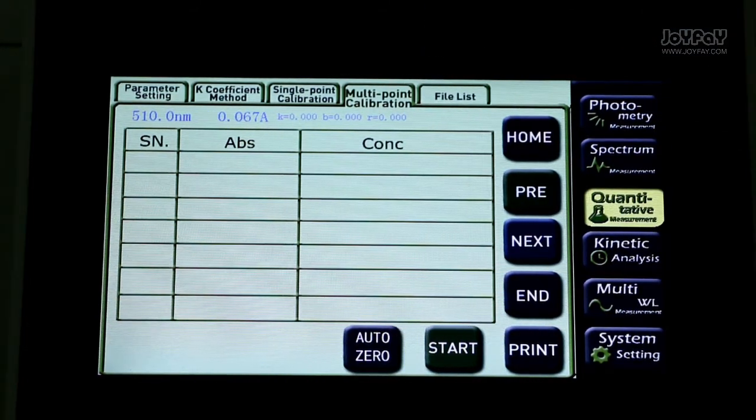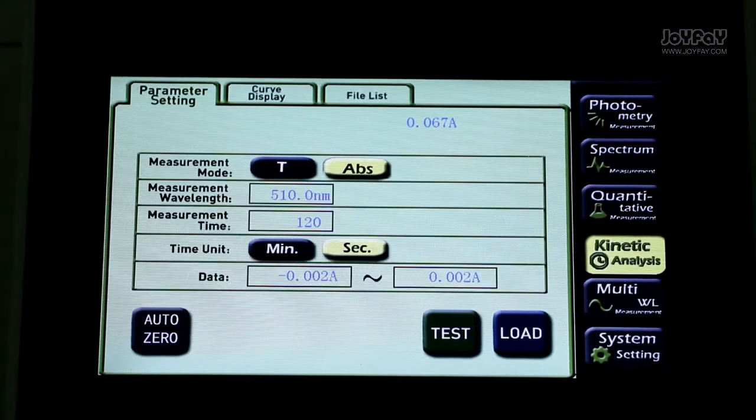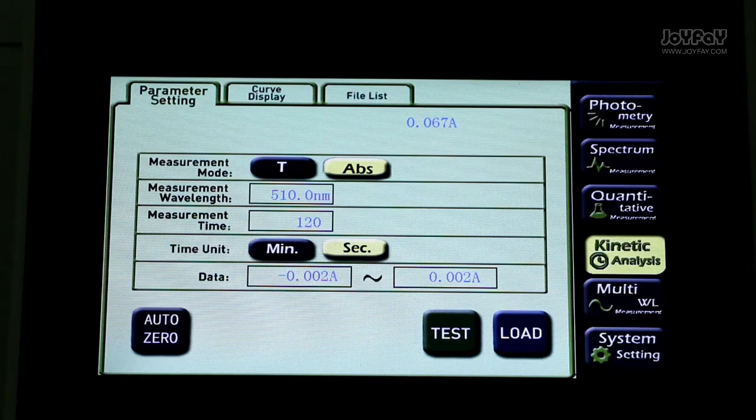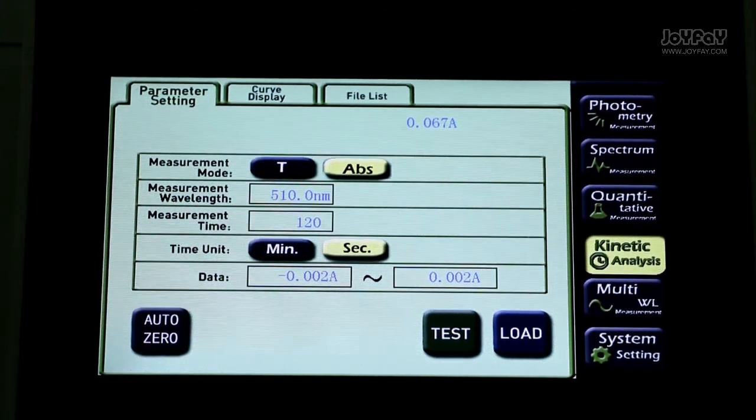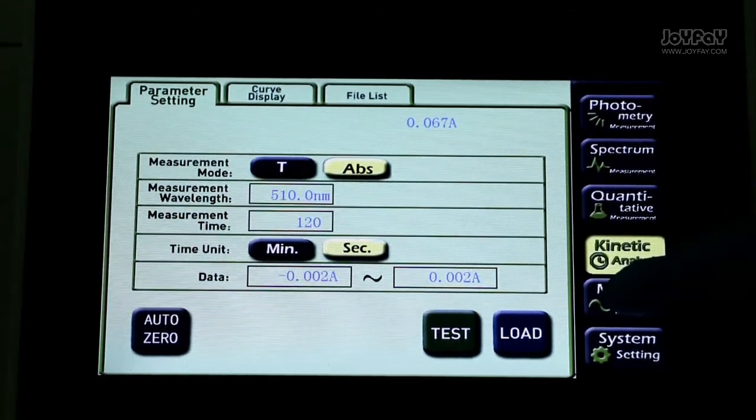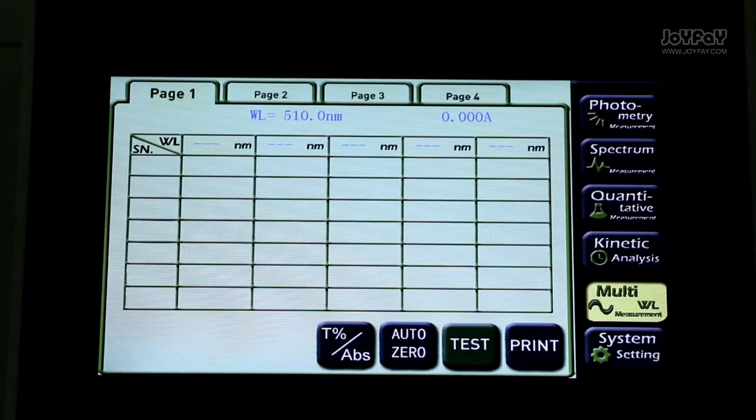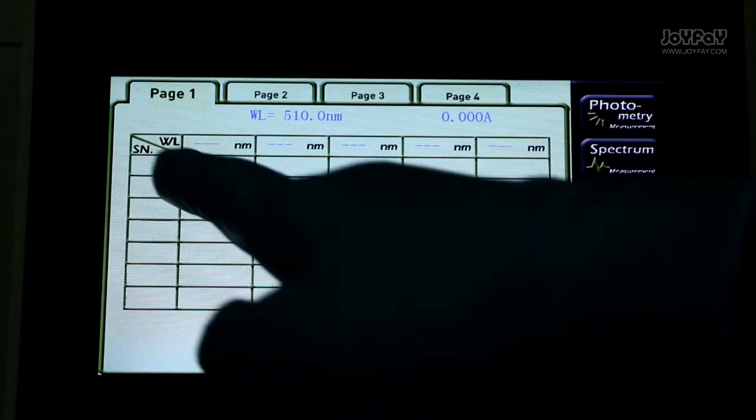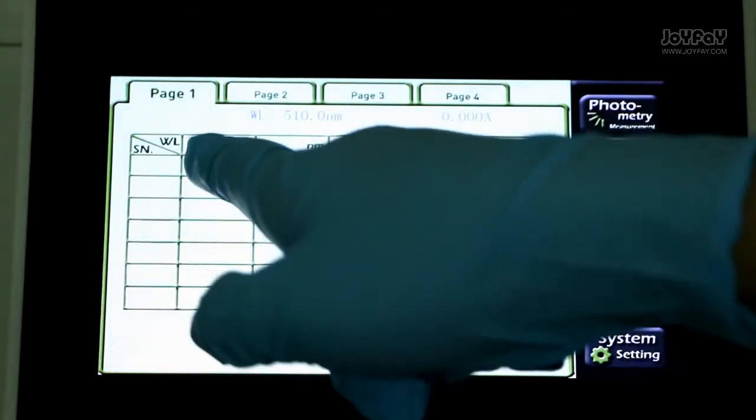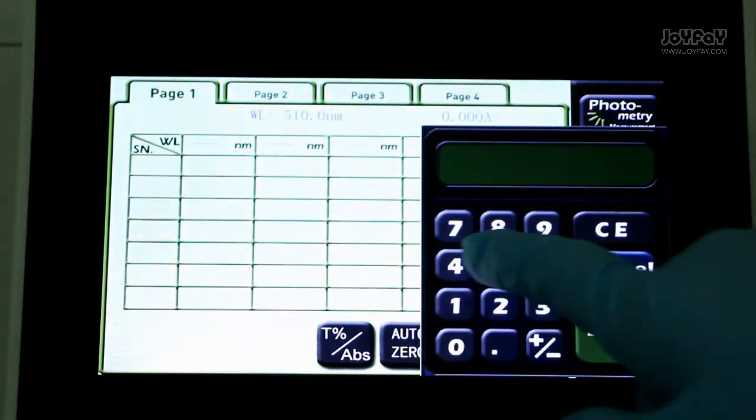The next one is kinetic analysis. We can see how the concentration changes over time in this measurement. In this measurement, you can test the absorbance values of the same sample at different wavelengths. Press the blank box here to set wavelengths and the number of the sample correct.